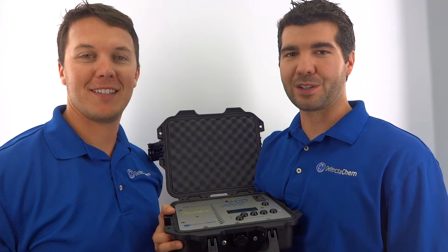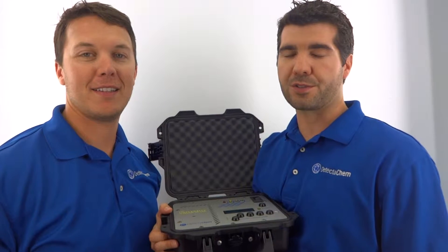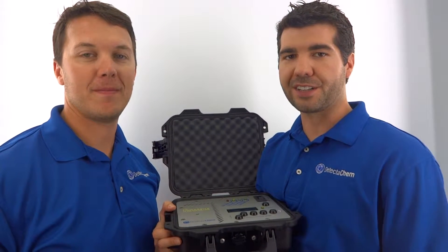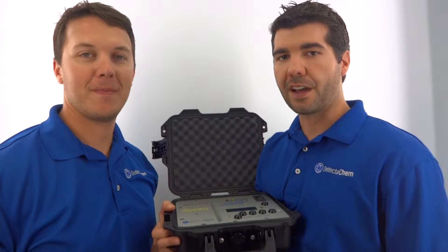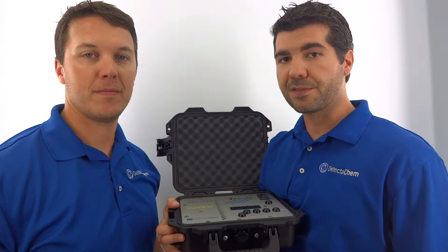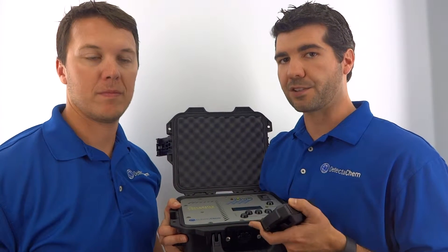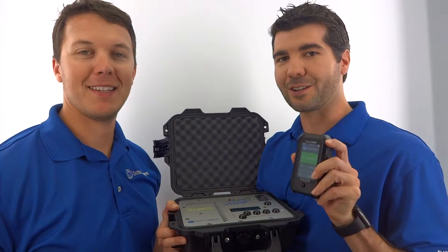Hey, Chris and Travis here again with DetectaChem. In a previous video we showed you our new microsphere heater used to safely extract a hazardous explosive from microspheres that were developed in conjunction with the University of Rhode Island. In today's video we're going to show you the combination of using our microsphere heater and our new handheld explosives detector called the Seeker E.